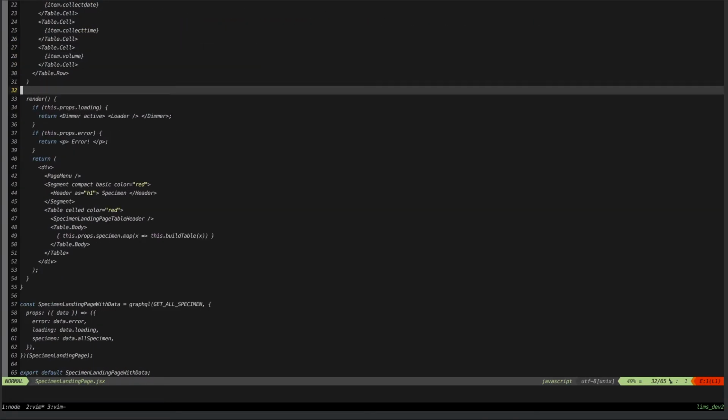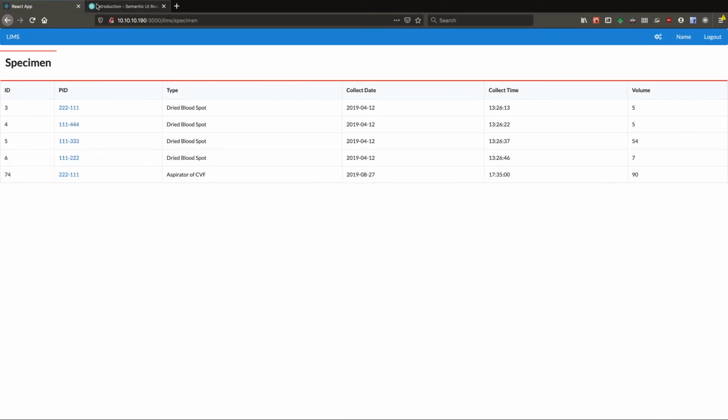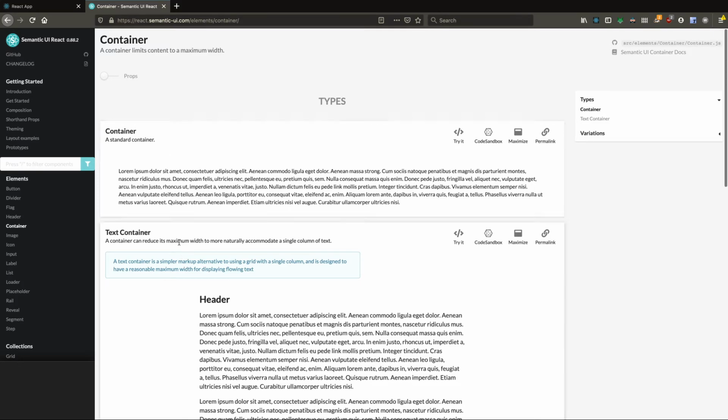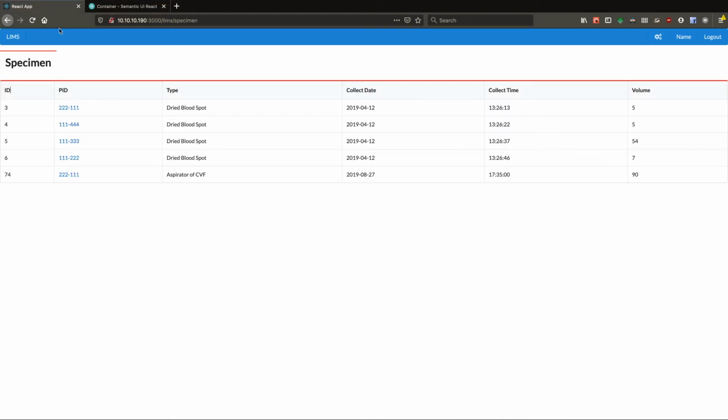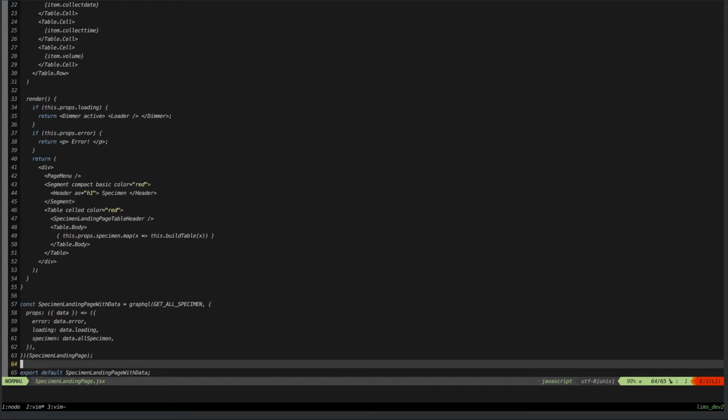Anyway, down below, I always use render, which, if I haven't mentioned it, a lot of the CSS is handled by Semantic UI React. I highly recommend checking out this library. It's just fantastic. It lets me cheat on the CSS portion, which is where I feel like I'm weakest as a developer. CSS feels like its own field in and of itself, and there's just so much that happens there. This lets me build things rapidly, so I don't have to worry about all the CSS portions of the code. But it's got all sorts of cool stuff to work with. If you see any import from like this object here, dimmer, which isn't defined someplace else but is from Semantic UI React, that's what that is.